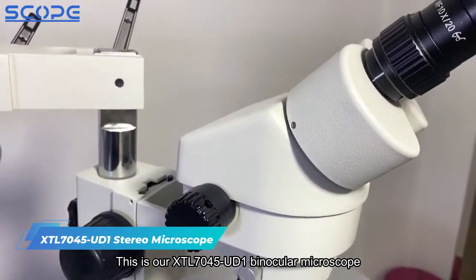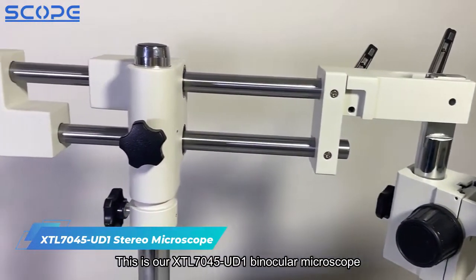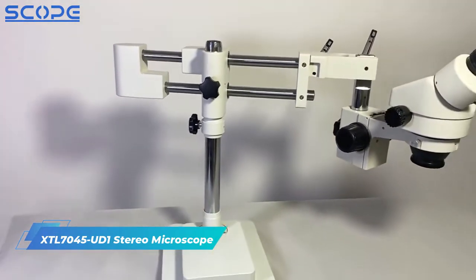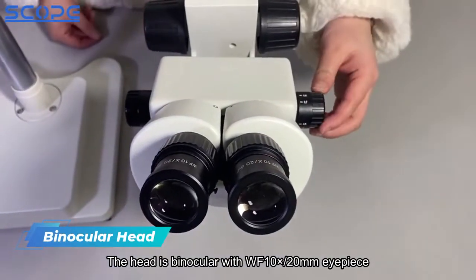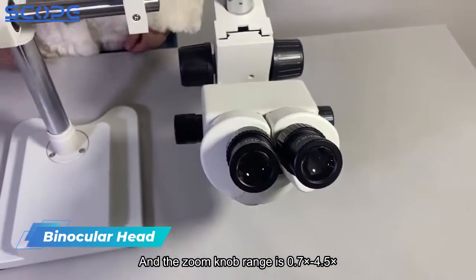This is our XTL7045U D1 Binocular Microscope with double universal stand. The head is binocular with WF 10x 20mm eyepiece, and the zoom knob range is 0.7x to 4.5x.